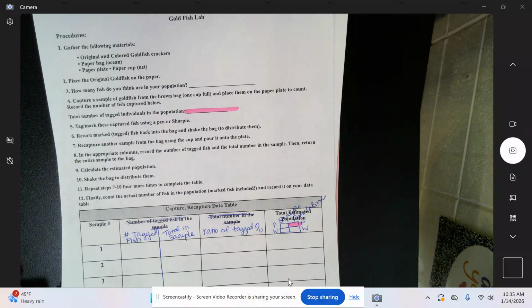So people really do this. They go out and they tag fish or whatever wildlife. Okay, so you want to tag every single fish that you caught. We'll do it quickly. Tag every fish that you caught. Once you have finished, you have to put a mark on every single one of the fish that you caught. That's why I said leave it laid out.